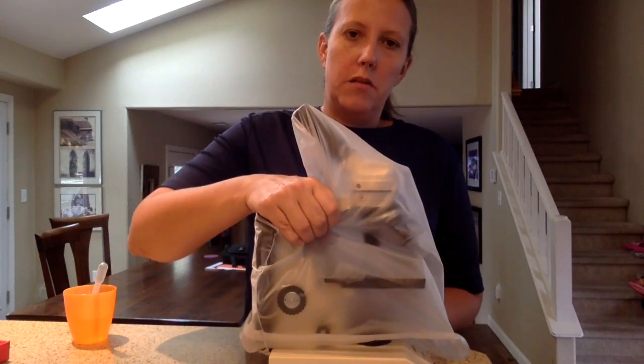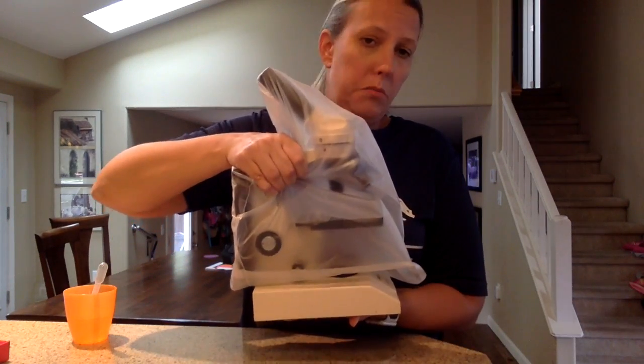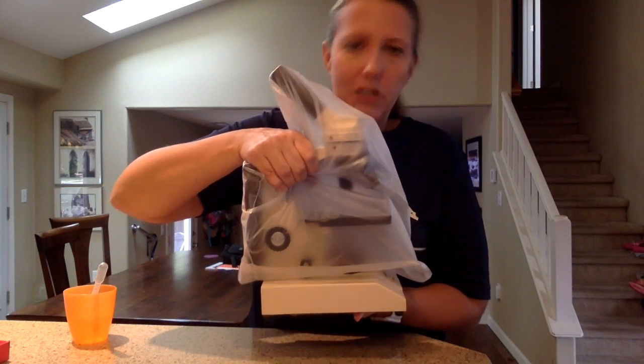Make sure that you always carry it with one hand on the arm and one hand on the base — two hands. These are not cheap, and you don't want somebody to bump into you and drop it, so always use two hands.